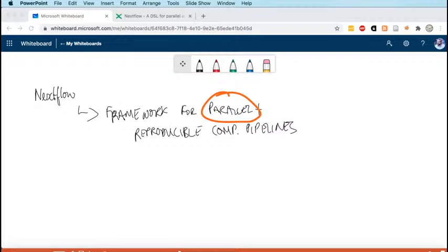Your Nextflow scripts are also going to be portable, they're reproducible, and one of the really nice things is the way in which they're enacted is independent of the script itself. That really comes into its own when you're thinking about where you actually want to run this compute. Do you want to run it locally, or on a high-performance computing server, or in the cloud?